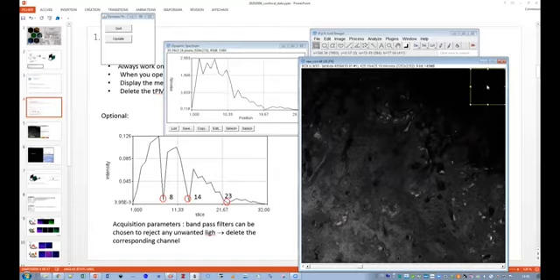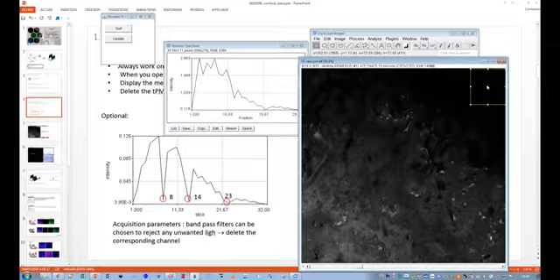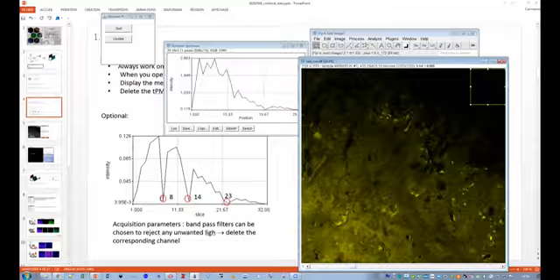Juliette, sorry to interrupt you. One thing I wanted to make sure of: what exactly did you have to delete before you process your data? I understood what you did with the data, but what is the problem with these channels you have to delete?